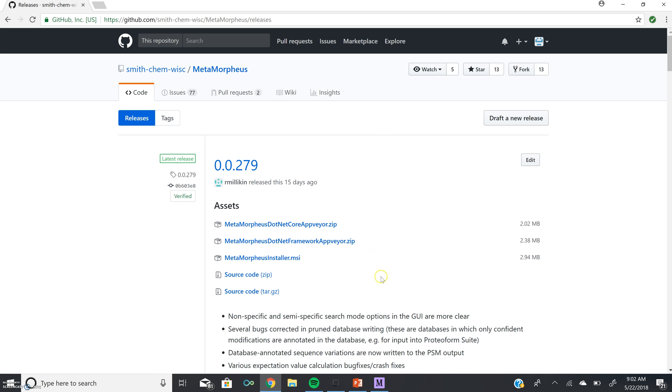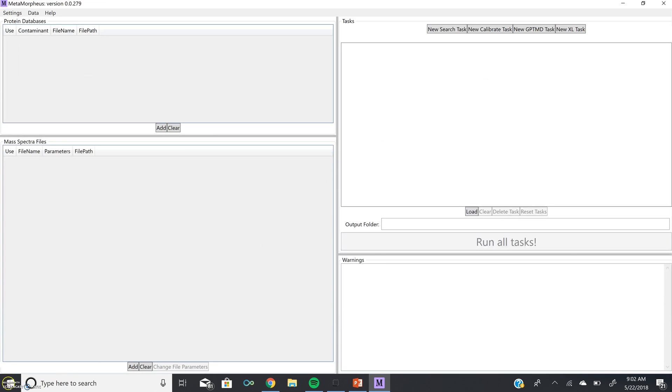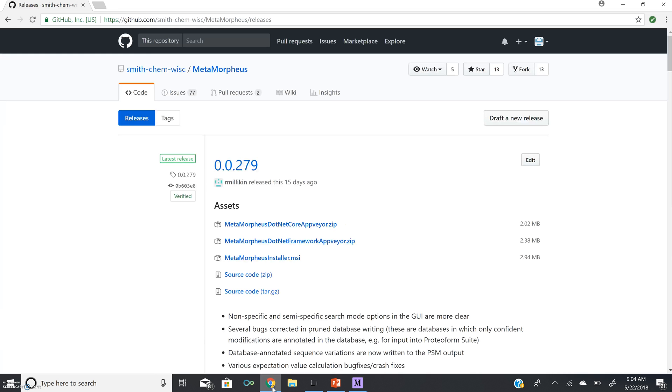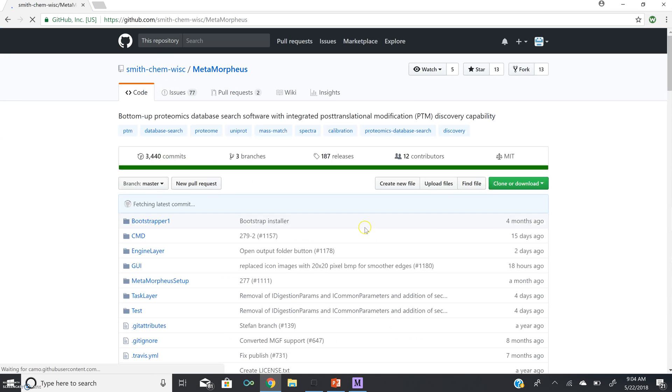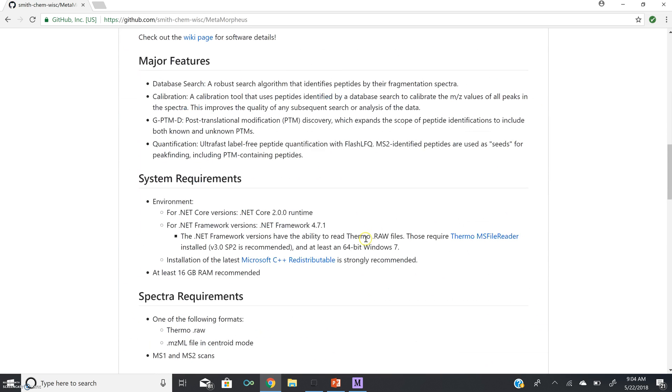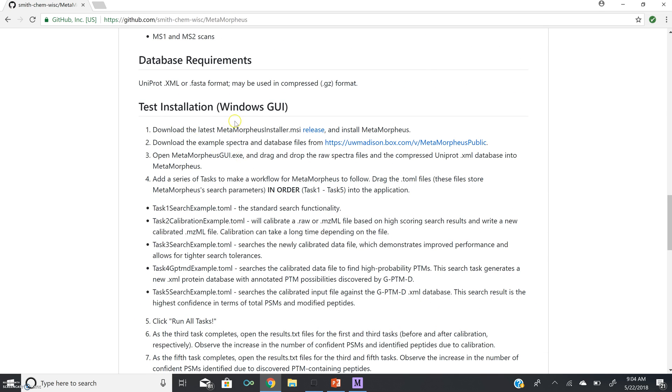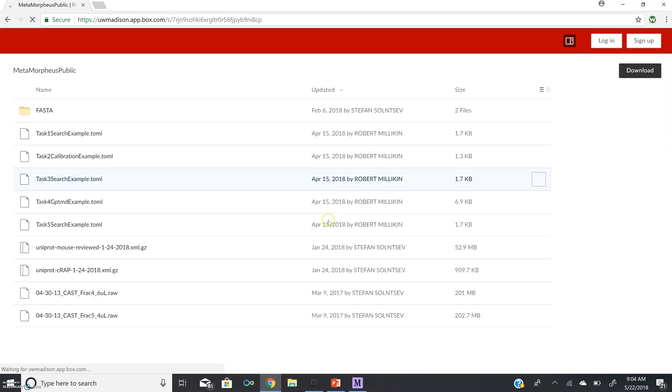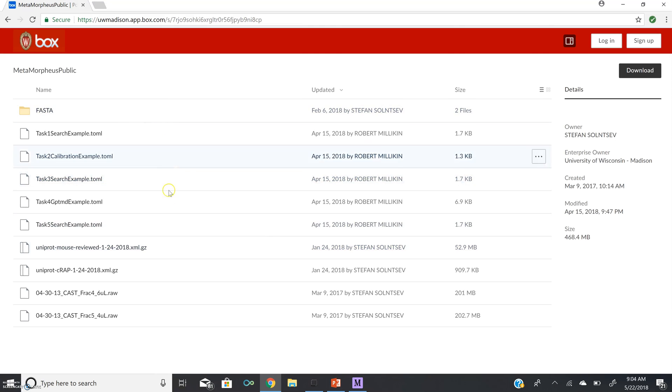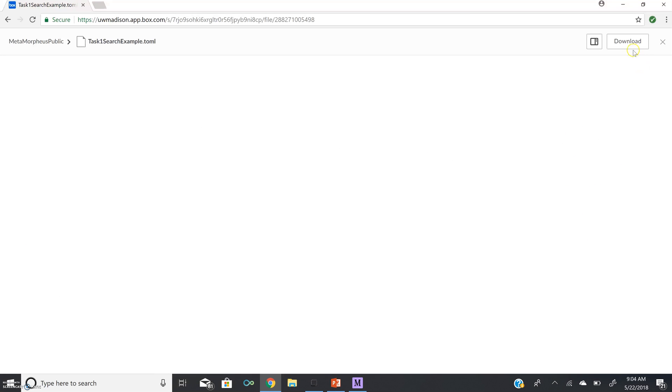And this will open up an instance of the Metamorpheus GUI. Now that we have downloaded Metamorpheus and opened the Windows GUI, we want to test installation. And we can do this back at the GitHub page through a vignette or sample databases and Spectra files. So if we scroll down to Test Installation of the Windows GUI, we can go to this link here for the UW-Madison box and Download Files. So here, we are going to first download a search task example. Download.